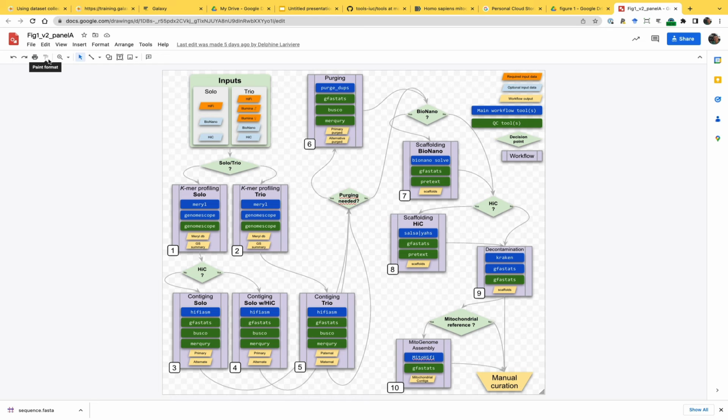This is the assembly part, which uses HiFi to do the assembly. That's the computationally intensive step. For example, BWA jobs, which we were just running, go to a node with 6 cores, but these jobs go to nodes with 128 cores and about half to 3/4 of a terabyte of RAM.